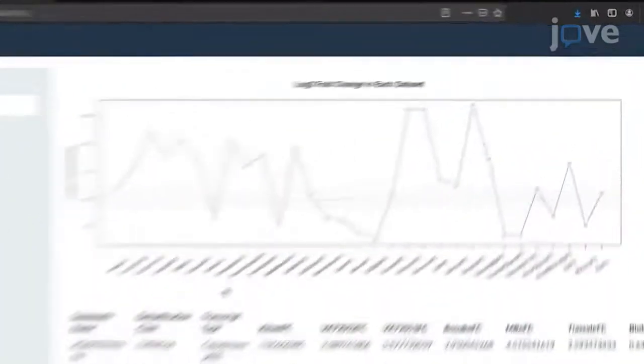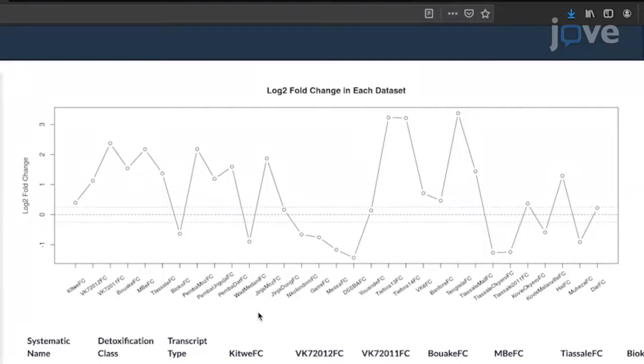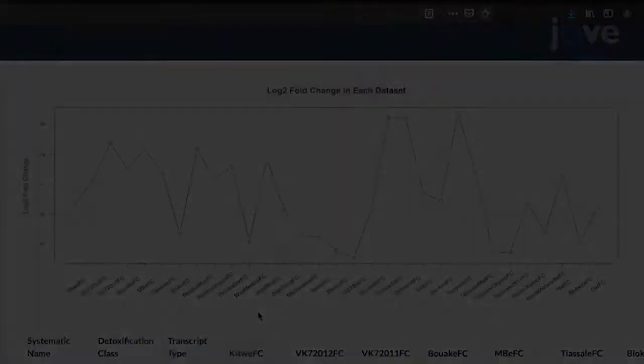Read the first graph as the log2 fold change between a resistant population and a lab-susceptible mosquito population of the transcript of interest across each dataset that meets the selected criteria.